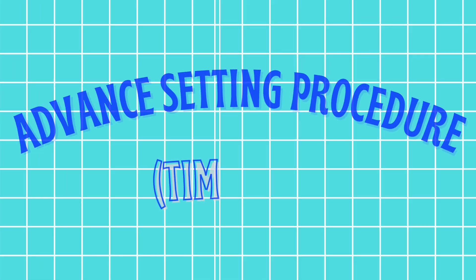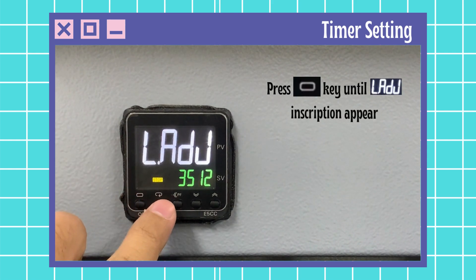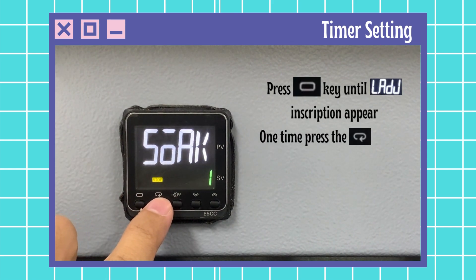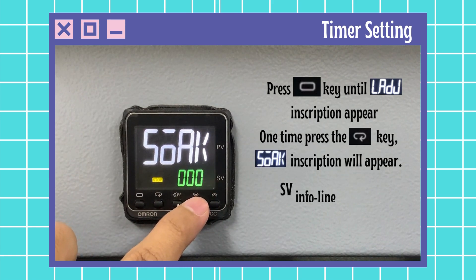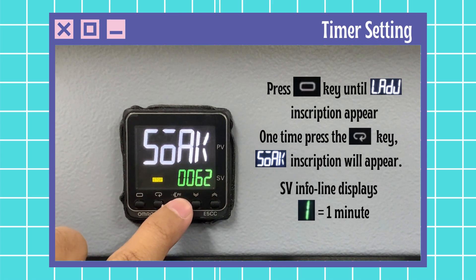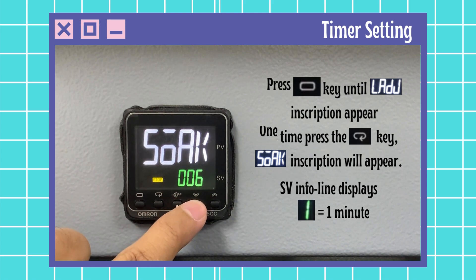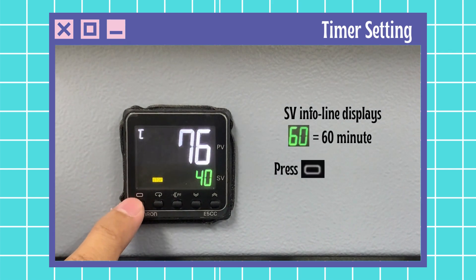Advanced setting procedure with timer on. Press the level key until the inscription appears, then press the mode key until the inscription appears. The set value info line displays 1 equal to 1 minute. You can set your time — for example, 60 minutes as temperature maintaining time — by adjusting the up and down key. Press level to return back to the main display.